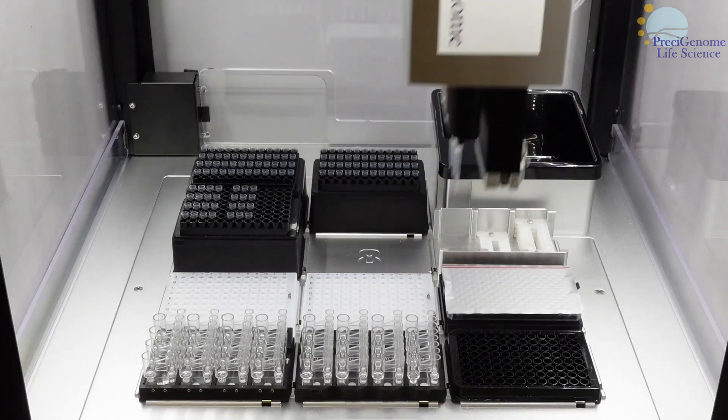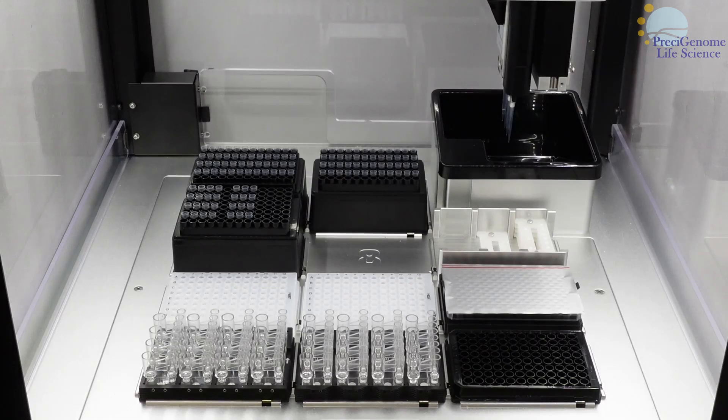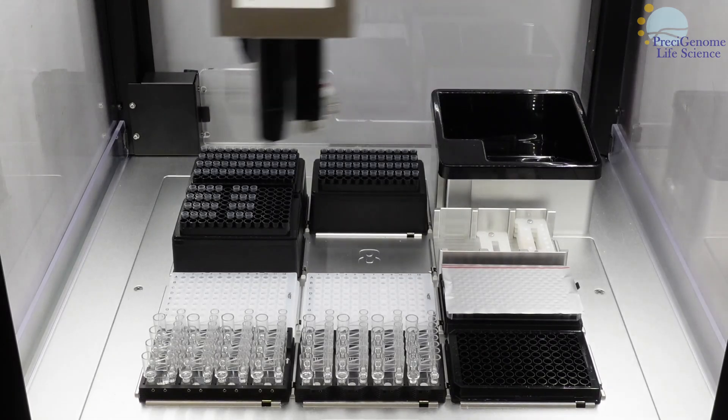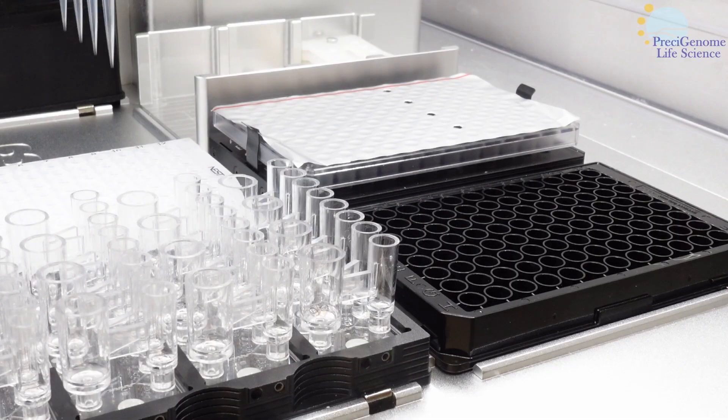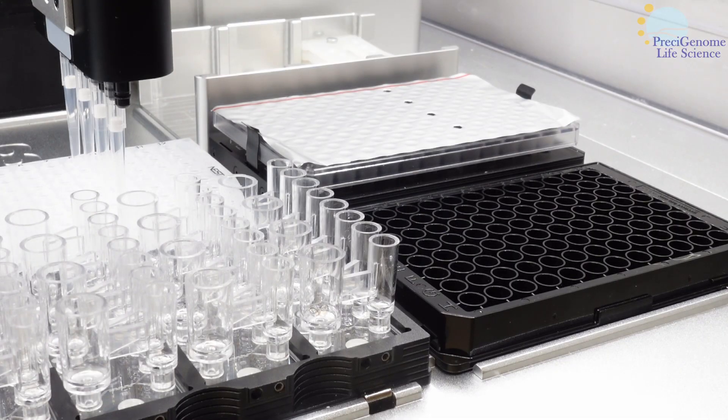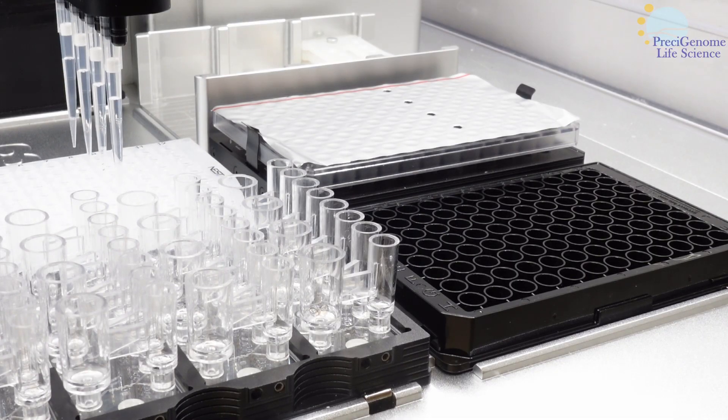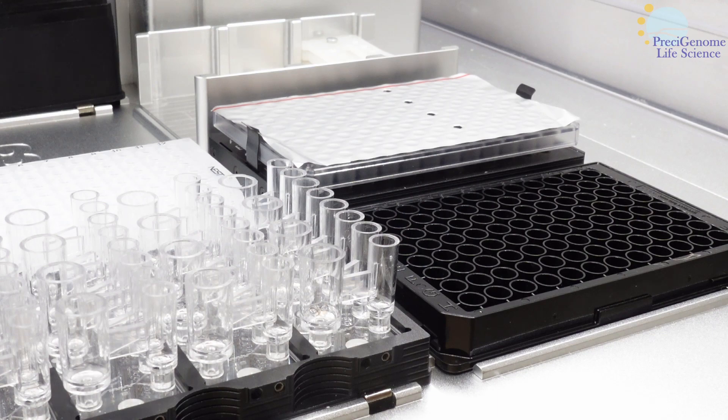The FlexS Plus is a workstation that employs pressure-based microfluidic mixing. Its external pump provides air for the robotic arm, which also serves as a liquid handler.